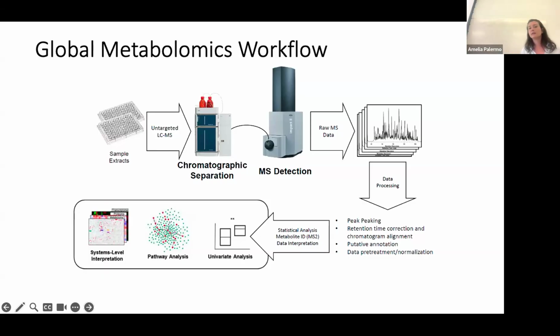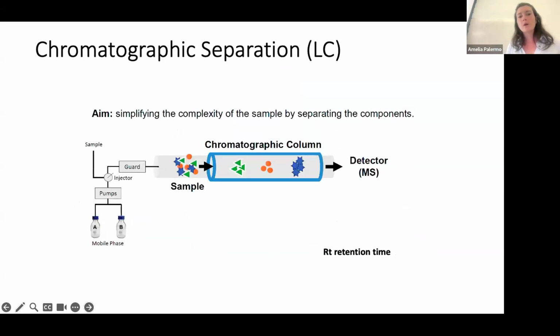As we will see later, we can do this in two different degrees of depth and using different levels of identification or annotation. And then also integrating this information in the broader context of system level regulation, right? Proteomics, phosphoproteomics, transcriptional data, CRISPR-Cas9 screenings, and GWAS association studies. So really, there is a wealth of information that can be used to enrich the interpretation.